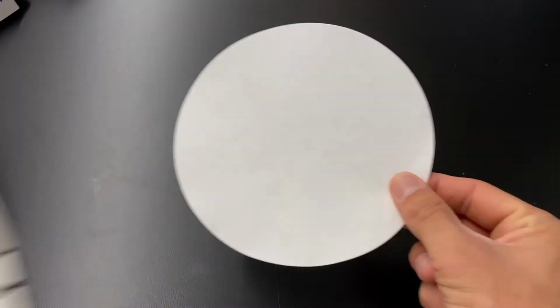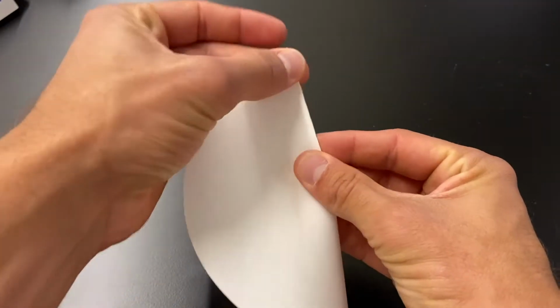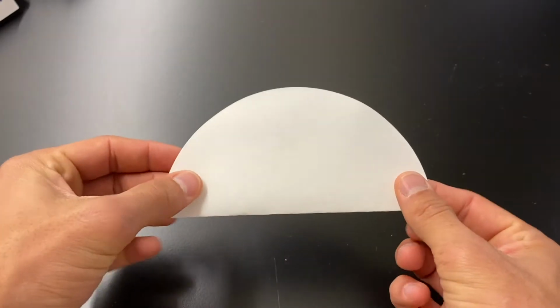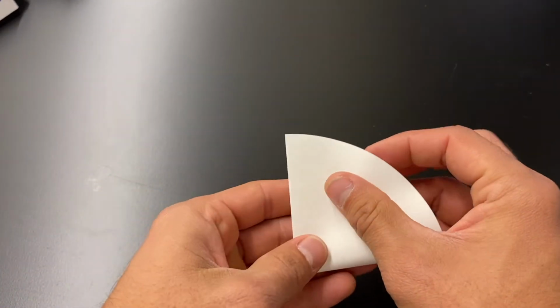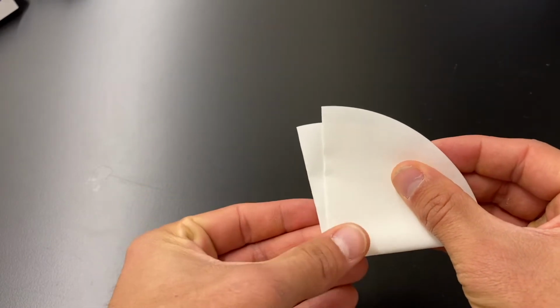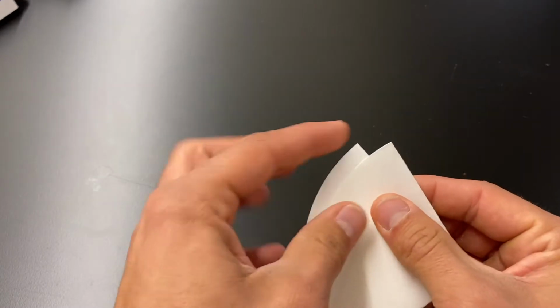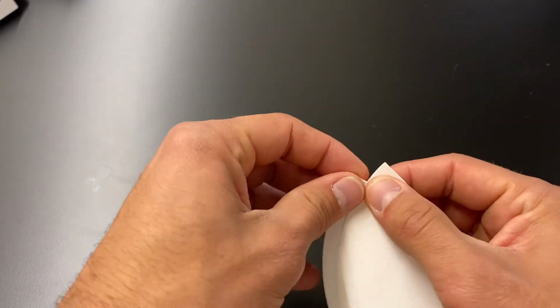The way we're going to do this is we're going to fold it in half. So this is how you'd set up a filter. Fold it in half. Fold it in half again. But this time you'll see I'll offset the fold a little bit like that, so I have a little bit of an overhang on the top. And then your final step is you're just going to tear off that extra piece right there.